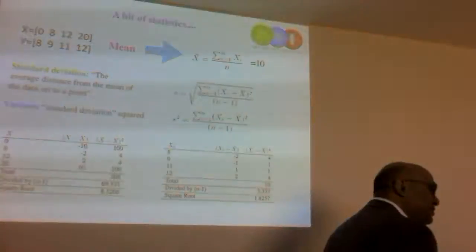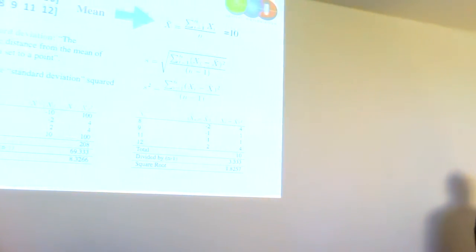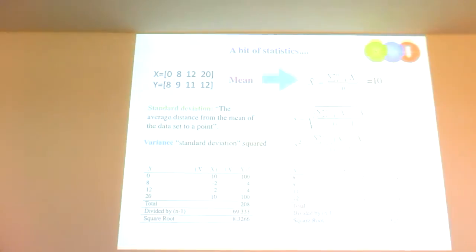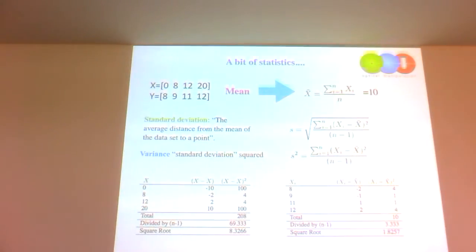So how do we do this? I'm just going to put this up. Many of you will have heard of multivariate statistical analysis. I'm not going to explain to you what PCA is. PCA is amazing. It's basically transposing these spectra in these instances into an eigenvector eigenvalue problem.